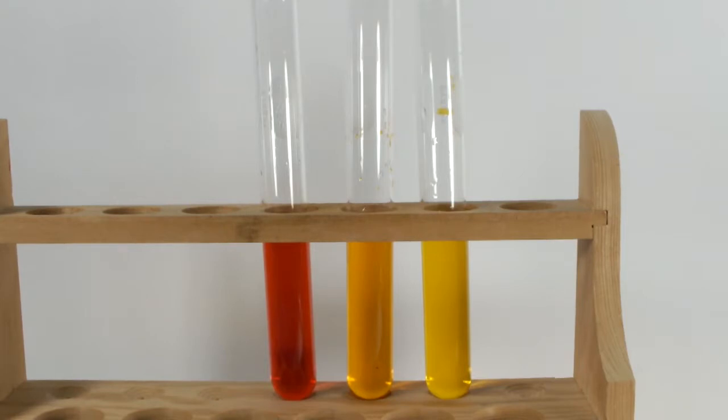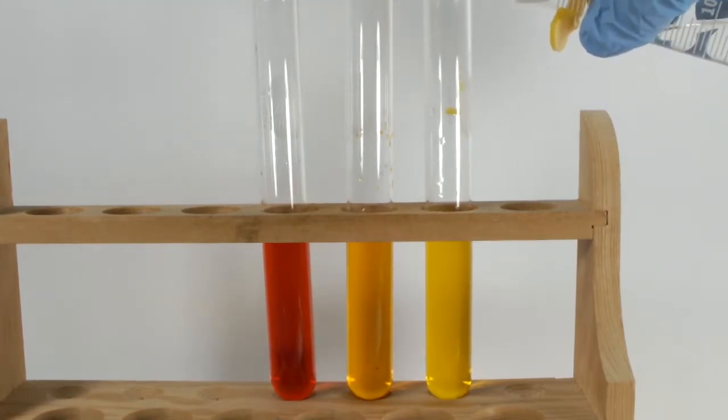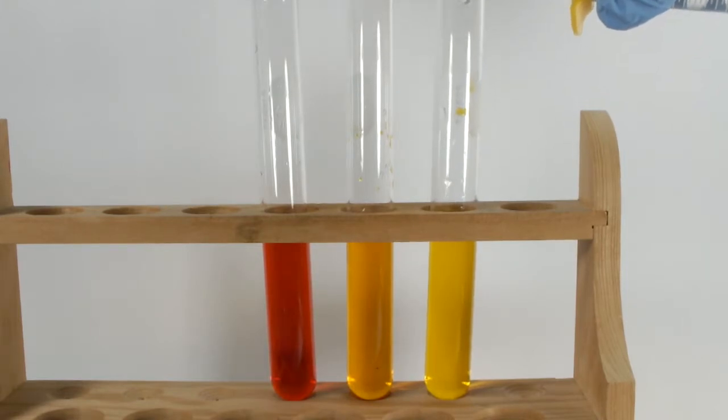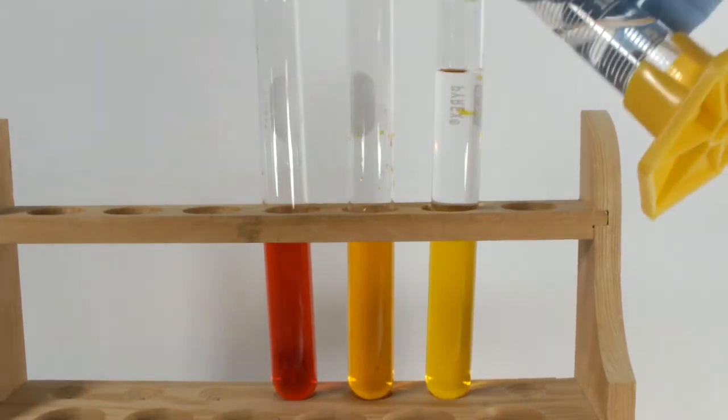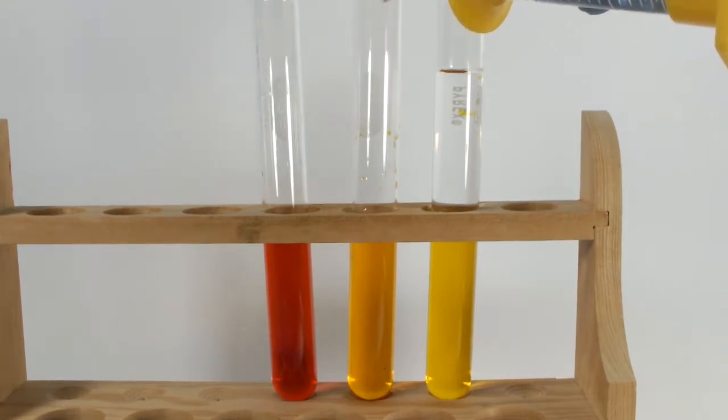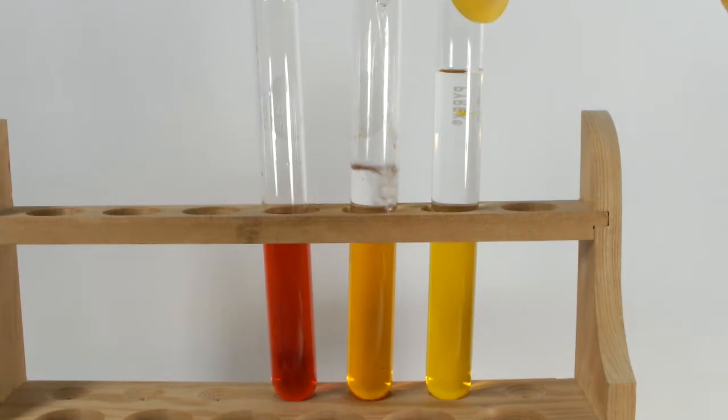The next step is to add 10 milliliters of petroleum ether to each of the three test tubes. Petroleum ether isn't chemically an ether. It's mainly a mixture of hexanes, cyclohexane, and naphtha, which itself is a mixture of all kinds of stuff.